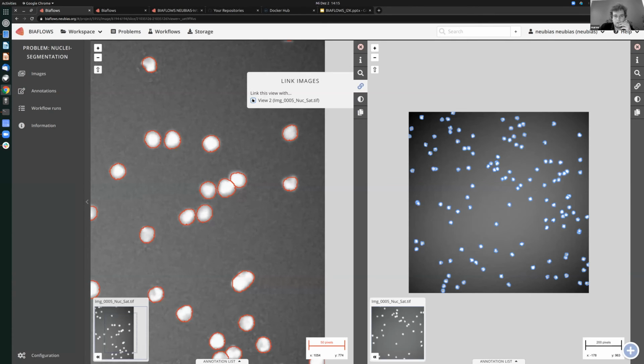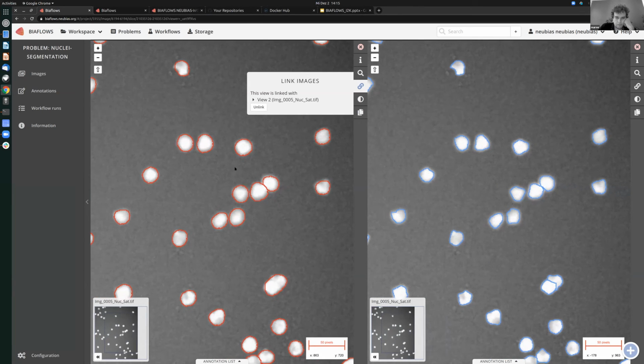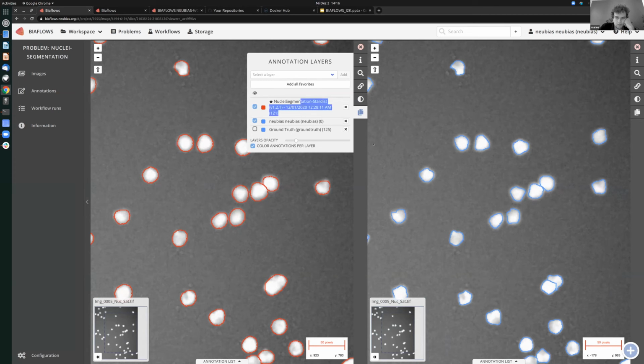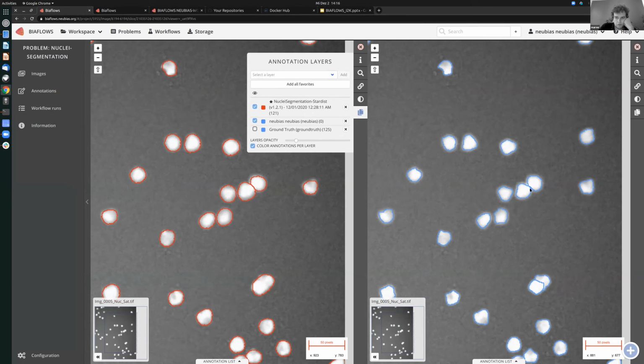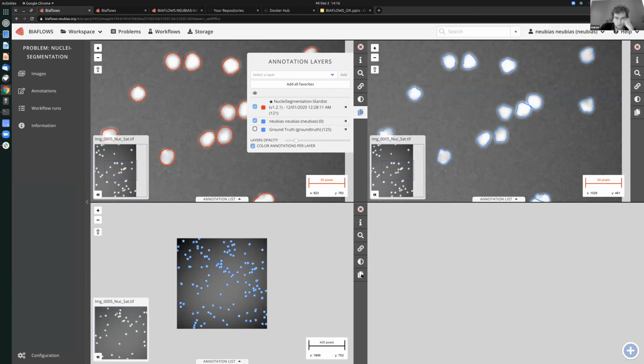Okay. On the left here, you have the detection of the StarDist workflow, and here you have the ground truth.